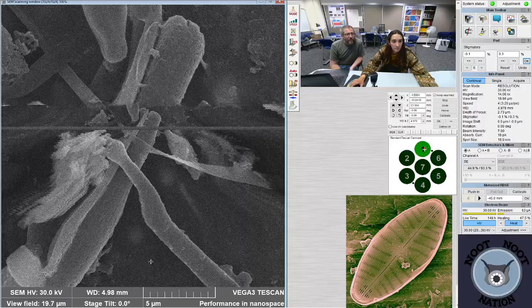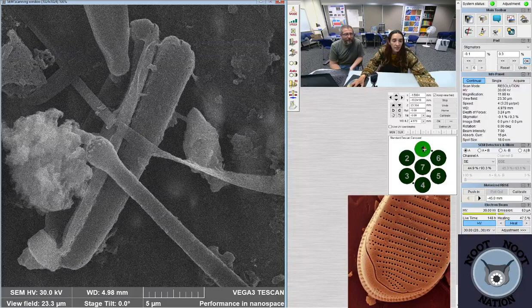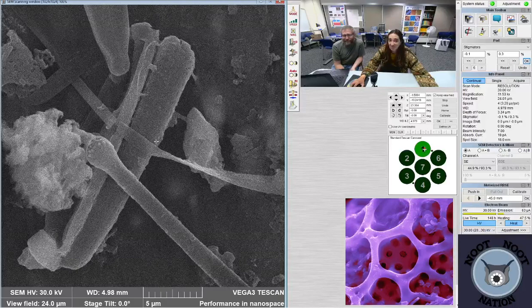It's spelled just like it sounds. Look at those cool spines on the end of that thing. These ones... I meant the... yeah, yeah. But this one is... Girdle view of a navicula.